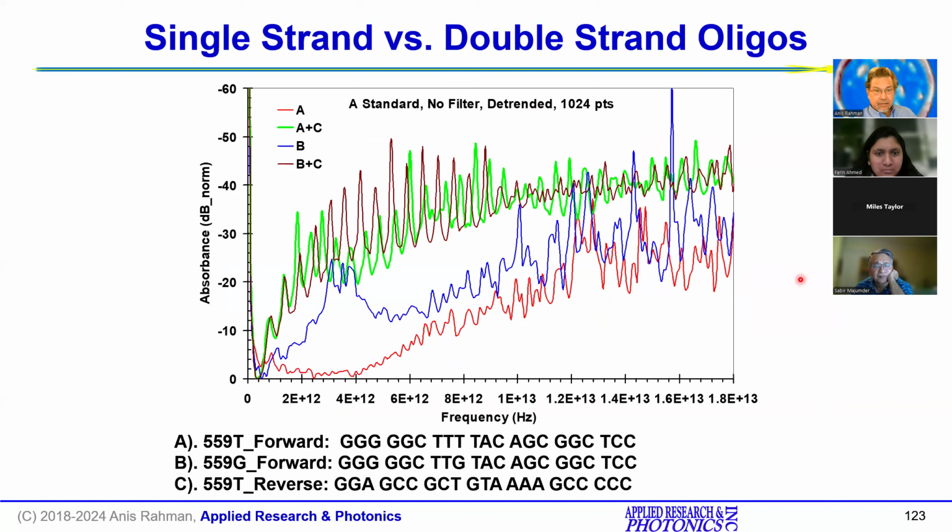These are the biochemists and biologists, they are experts in those things. We got the samples by collaboration with Penn State College of Medicine in Hershey. And so the question became: if you see the difference between the single strands for single nucleotide polymorphism, when they are hybridized, can you still identify or discern them? And that is the experiment we saw here.